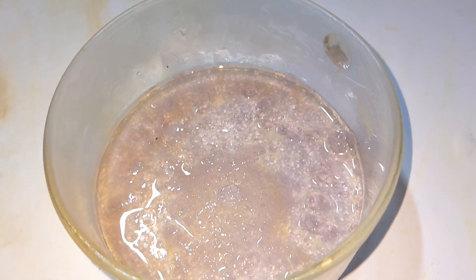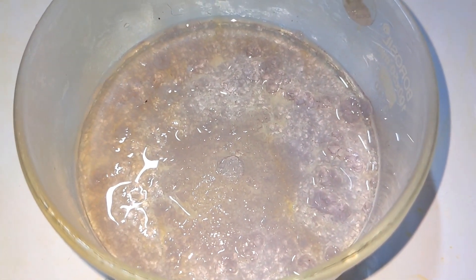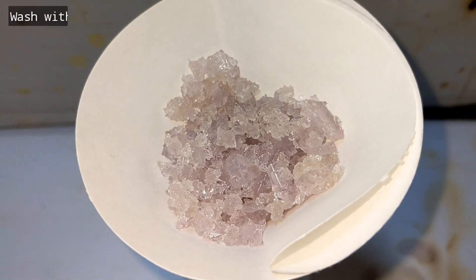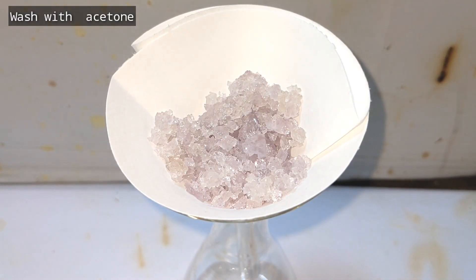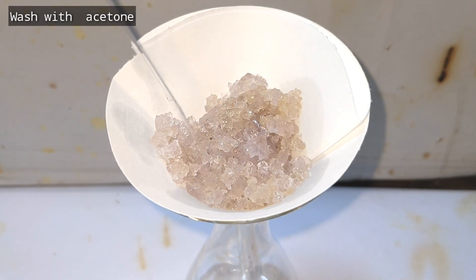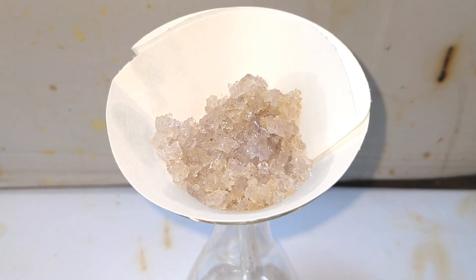By six to seven days most of the crystals had formed, but I still kept the container in a refrigerator for one day to ensure complete crystallization. Then I filtered the solution to obtain the crystals and washed them with acetone. You can very well notice the faint violet color of the ferric alum here.